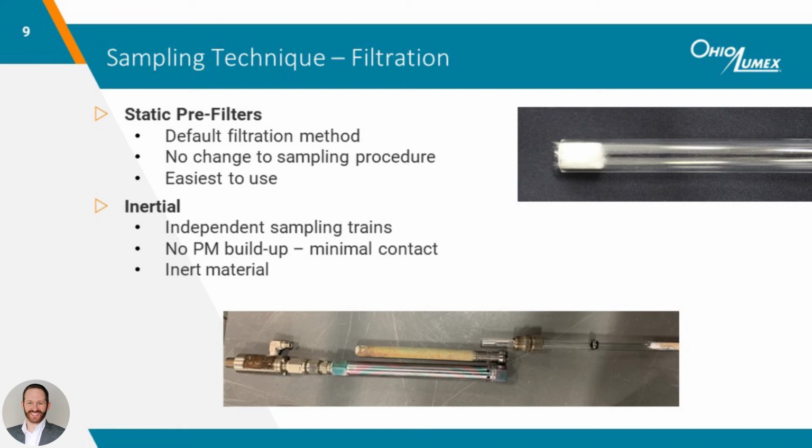Let's discuss those methods. Static prefilters are the default filtration method and will work for the majority of sampling environments. The static prefilter is essentially a plug of inert material placed into the trap.